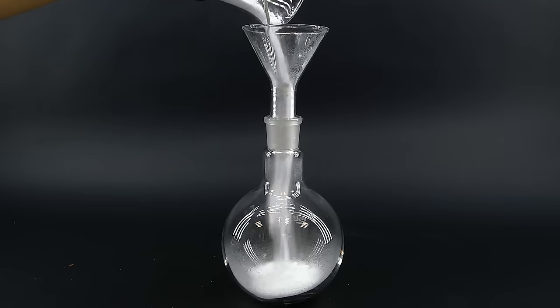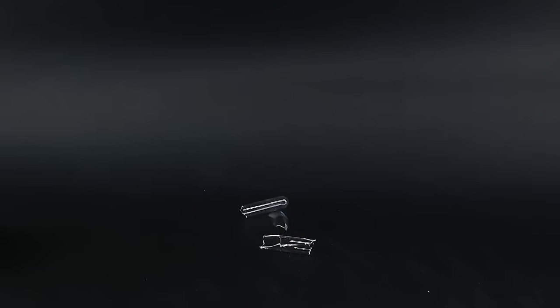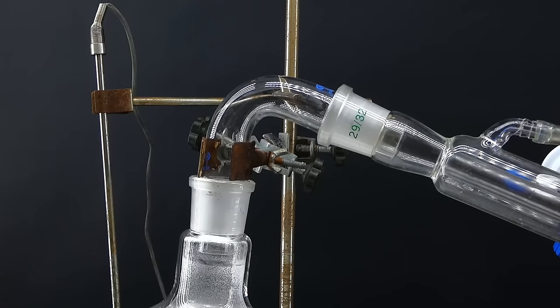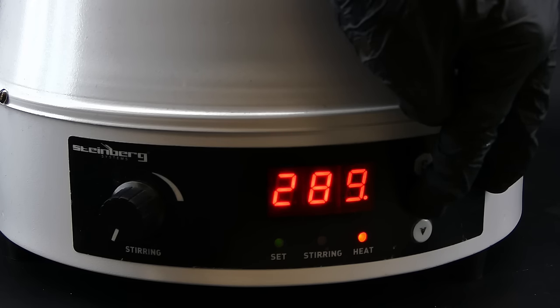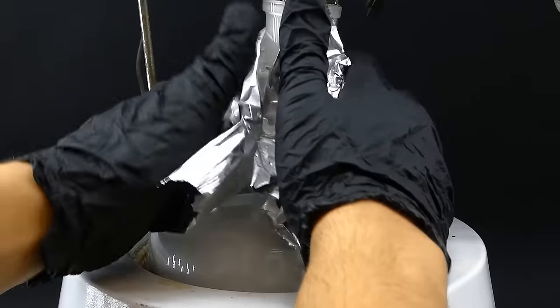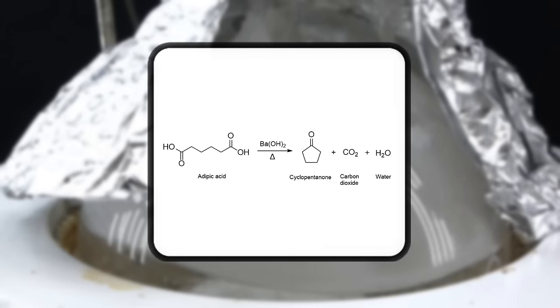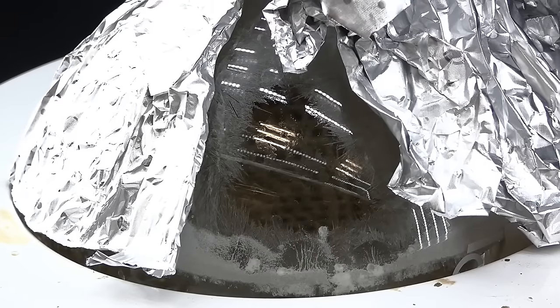I mixed the ingredients and got them into a 1-liter boiling flask. Before starting the reaction, I wanted to put some boiling chips in to help with the boiling later on, and since I was out of broken glass, I sacrificed a test tube for the greater good and added its remains to the flask. I then assembled a simple distillation apparatus without grease, because I will need to heat things up to pretty high temperatures. I cranked up my heating mantle to 300 degrees Celsius and put some aluminum foil around the flask to insulate it. As the flask heated up, the adipic acid began to melt and slowly decarboxylate under the presence of barium hydroxide, producing cyclopentanone, water, and carbon dioxide, while the cyclopentanone and water distilled over to the receiving flask. Also, as the boiling flask got very hot, the adipic acid started to sublime onto its walls, making a nice frost effect.